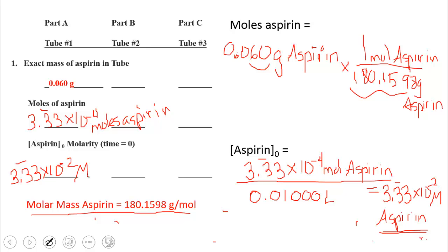Now, I used some data from test tube B, and again, this is not indicative of what you would see in your lab. This is just made up stuff. But let's just say I found the molarity in test tube B to be the following, because of course I've changed my concentration of aspirin for test tube B. So I would have done these exact same calculations and measurements for test tube B, and let's just say this is what I came up with. Okay, 2 significant digits there.